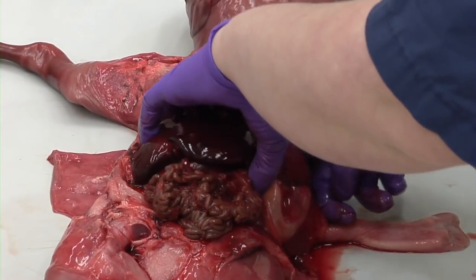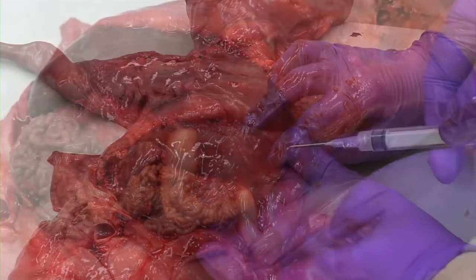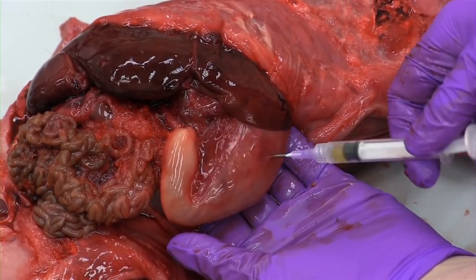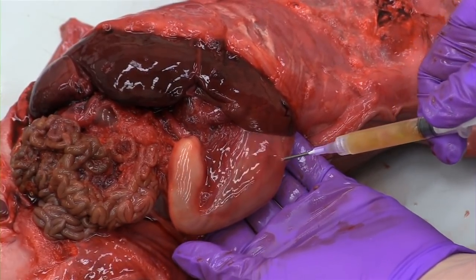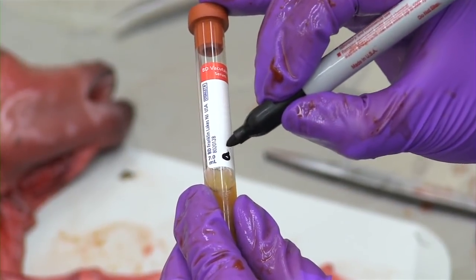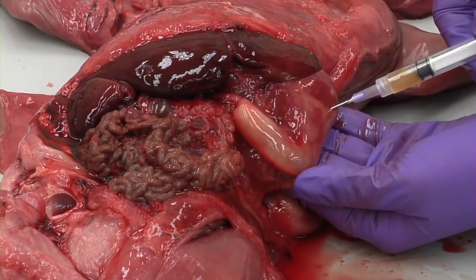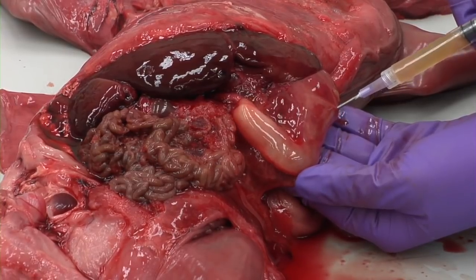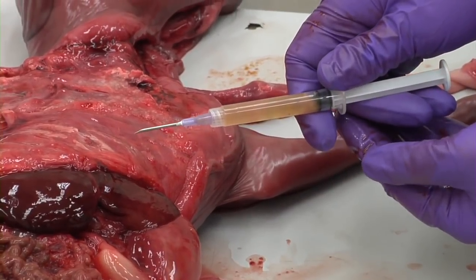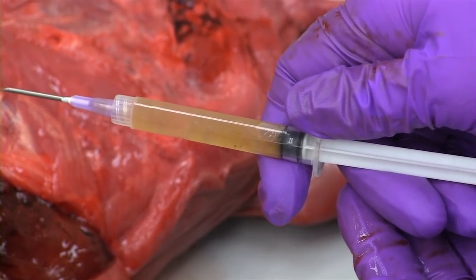Grossly evaluate the abdominal viscera for any abnormalities and begin taking samples. First, locate the abomasum — this will be the largest of the four stomachs. Using a needle and syringe, draw out two to three mLs of abomasal fluid and place it in a labeled red-topped tube. Please make sure to label the tube with the origin of the sample. The abomasal fluid can range from clear to yellow to red and is typically quite mucoid. If there is evidence of colostrum in the abomasum, this sample does not need to be collected. Abomasal fluid is particularly valuable for culture, including brucella, tritrichomonas, and campylobacter.